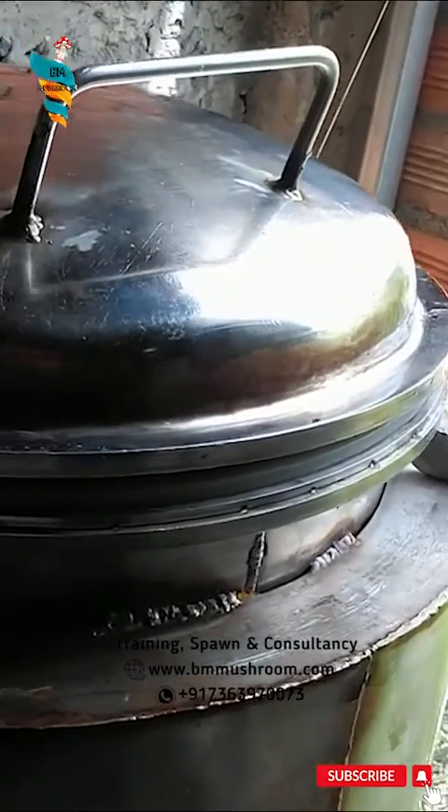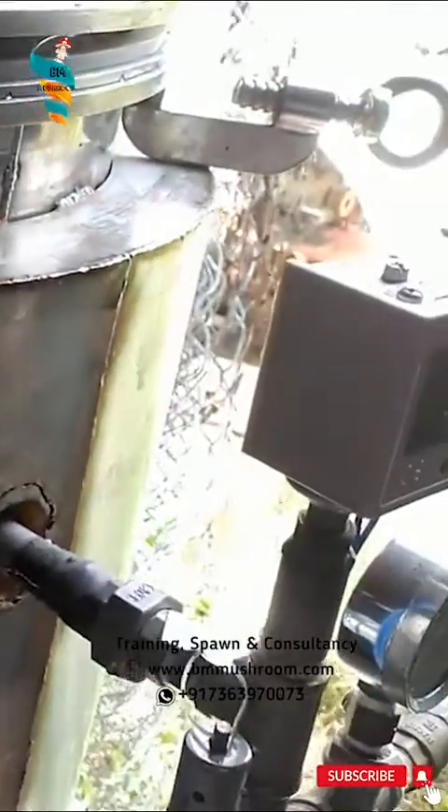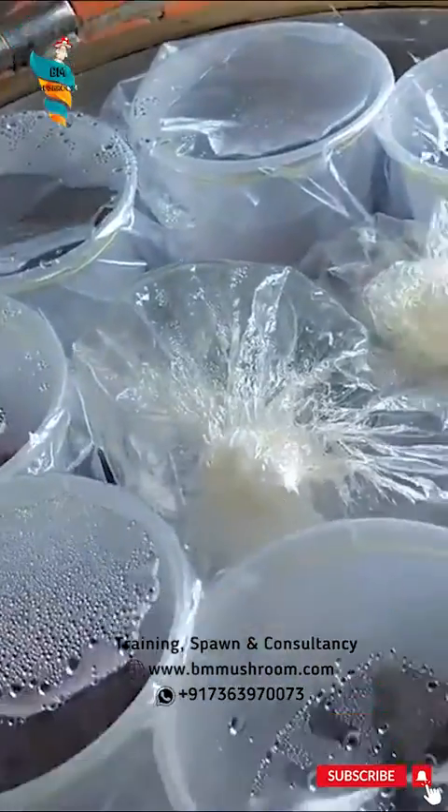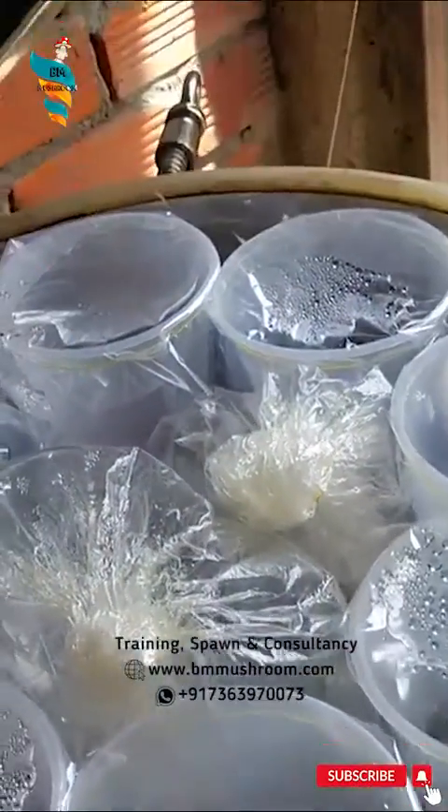Second, the autoclave room. This room is designed for the purpose of sterilizing the growing media of Cordyceps Mushroom. This room will also be around 150 square feet.